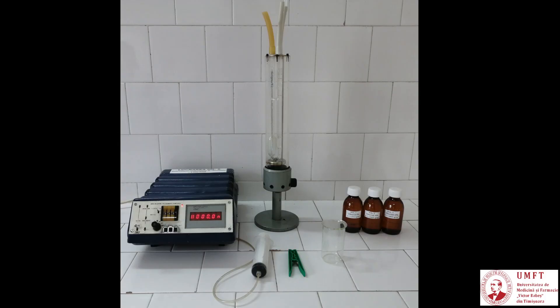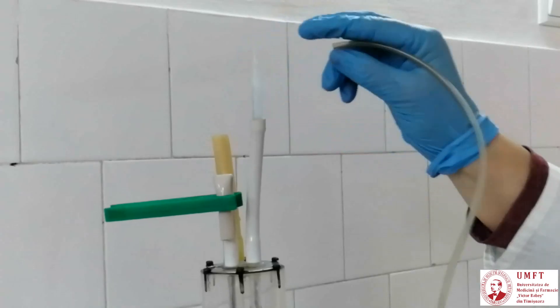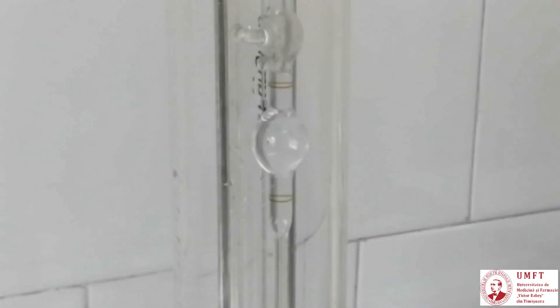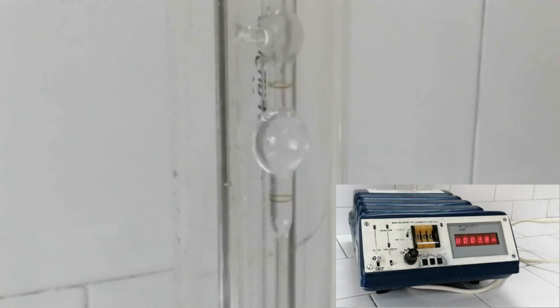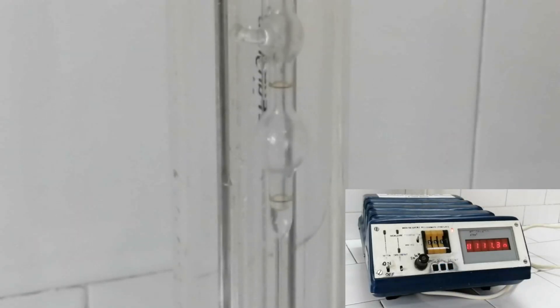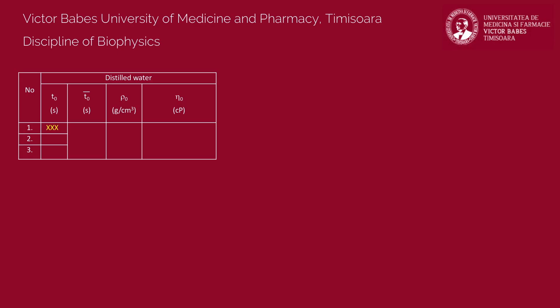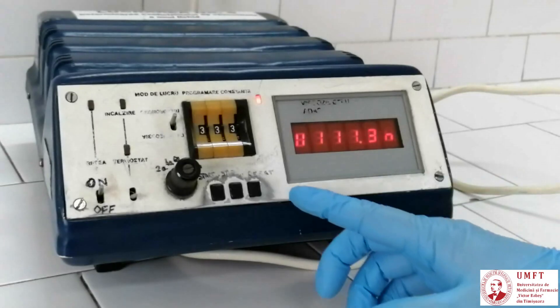First determinations will be performed for the reference liquid, which in this case is distilled water. Follow the previously mentioned steps for rising the water through the capillary tube to a level above the upper mark. Release the two branches. Press the start button to start the chronometer when the water level reaches the upper mark. Continue watching the water flow through the capillary tube. Press the stop button to stop the chronometer when reaching the lower level. Write the time of flow in the corresponding table. Reset the chronometer.